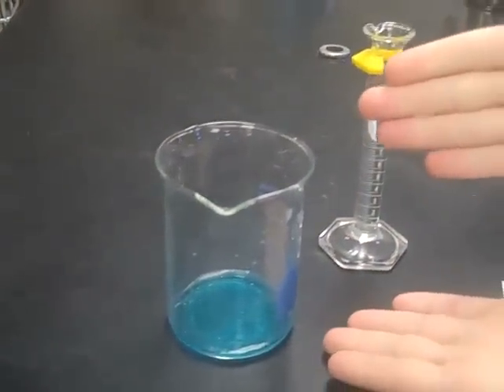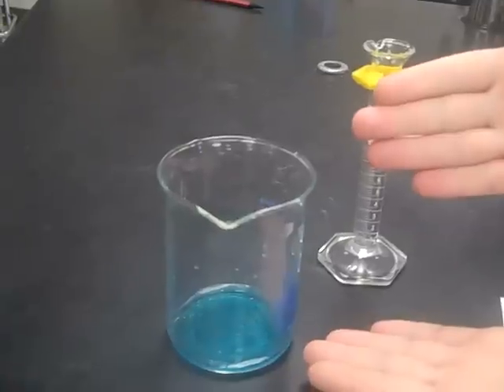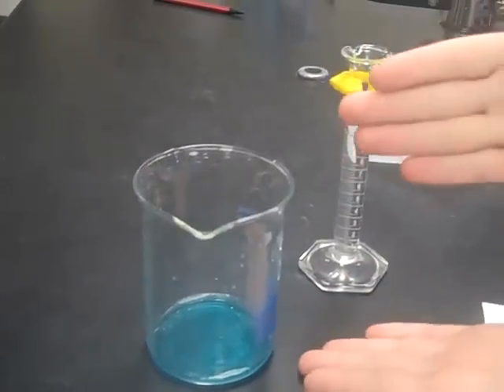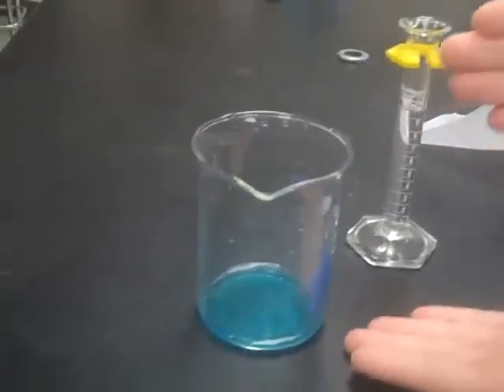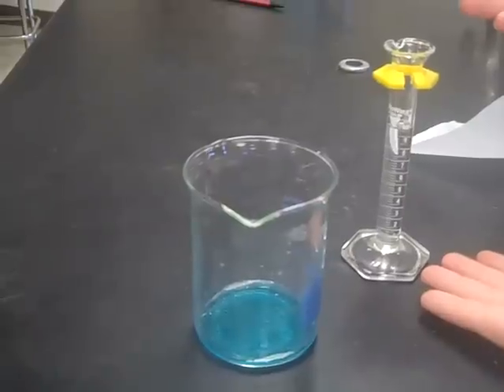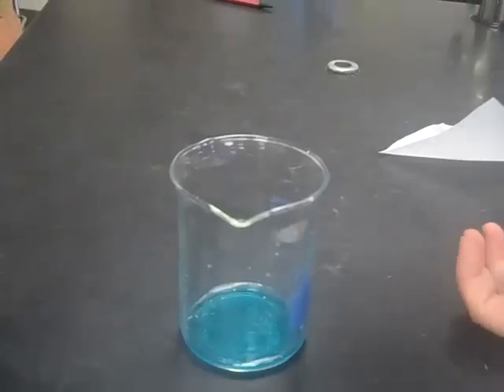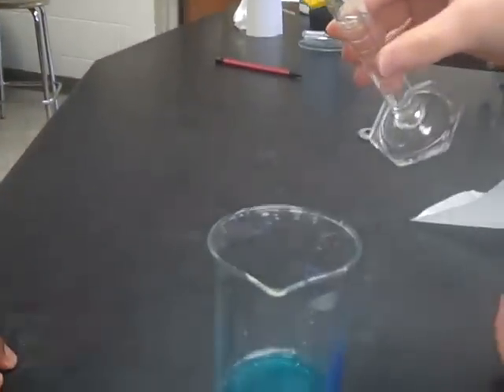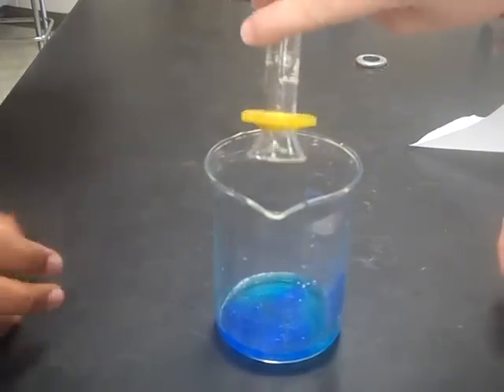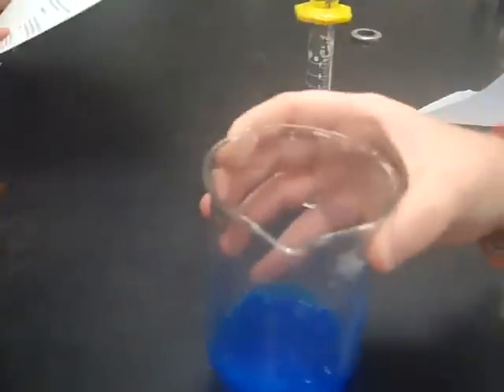Now we have a 250 milliliter beaker with dissolved copper 2 sulfate pentahydrate in distilled water. We are now going to add 10 milliliters of 6 molar sodium hydroxide. We are adding them together and will swirl gently because it will burn our skin.